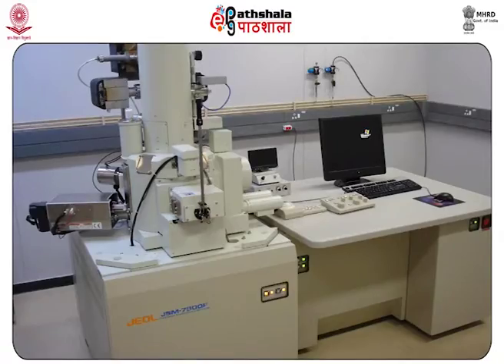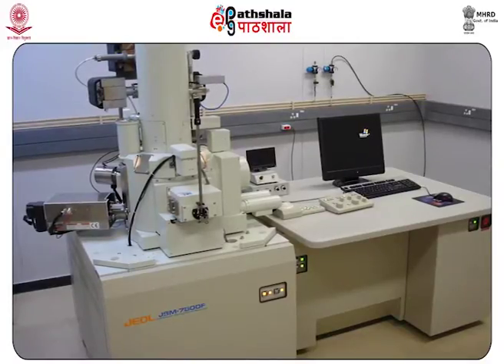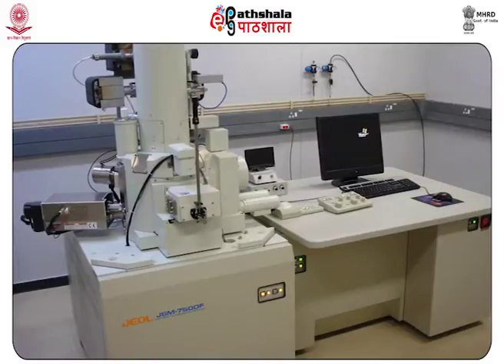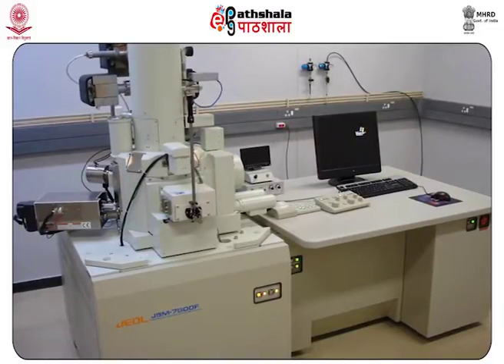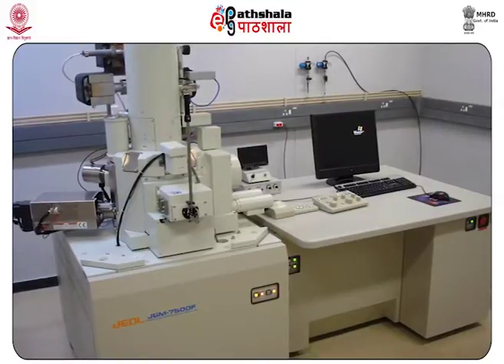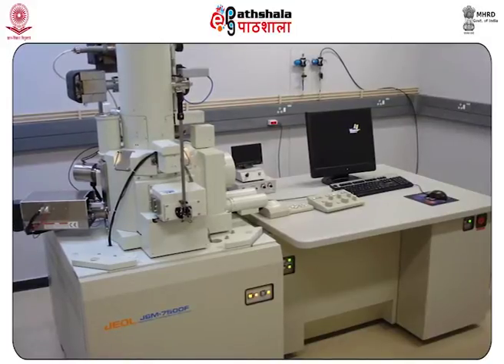And we have come to know that the most successful technique to date for the analysis of gunshot residue particles is the scanning electron microscope with an energy dispersive X-ray analyzer.